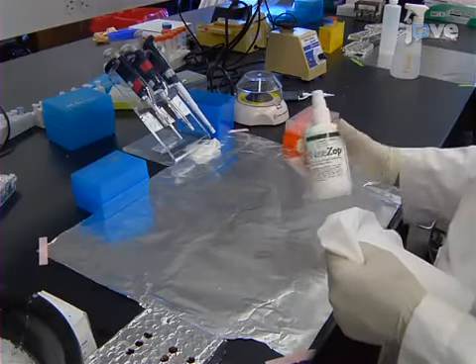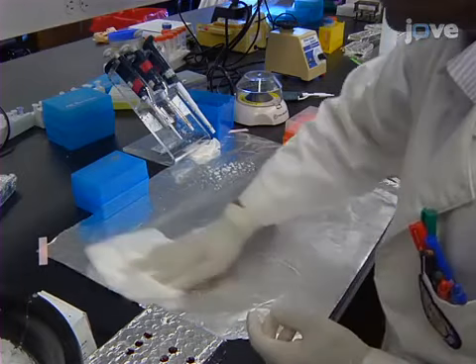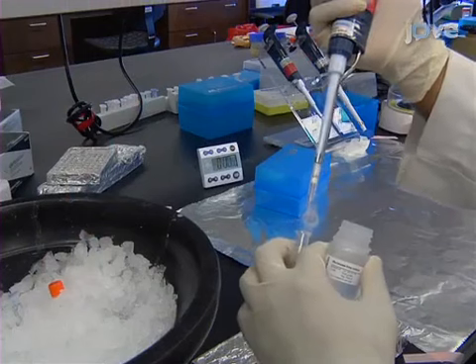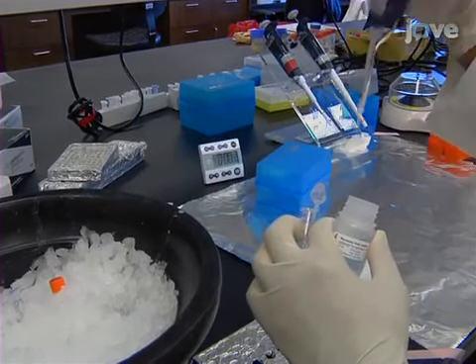First, spray the working area and pipettes with RNaseZap. To begin cDNA synthesis, dilute the template RNA samples to a concentration of 5 nanograms per microliter with nuclease-free water.